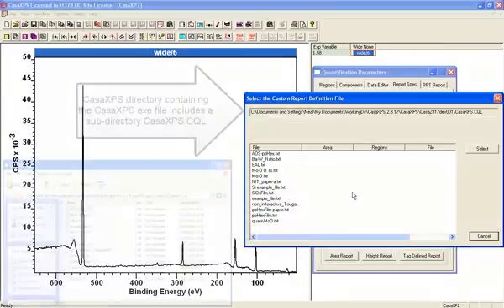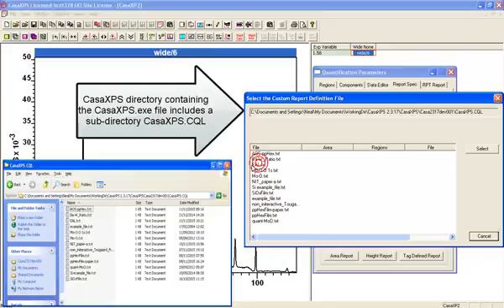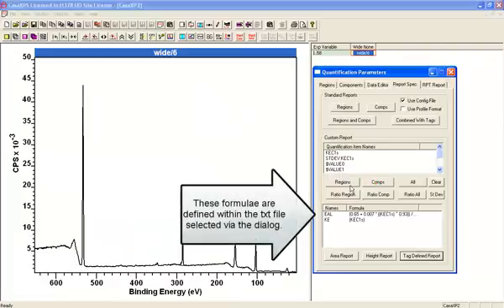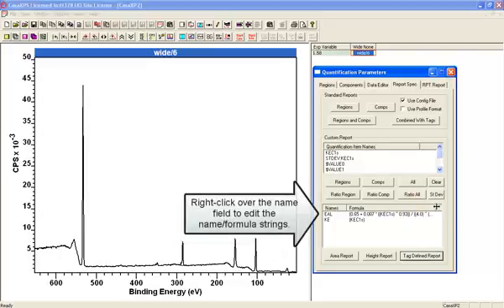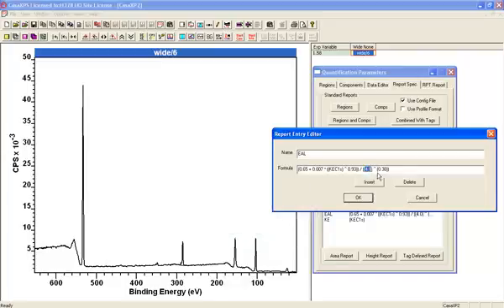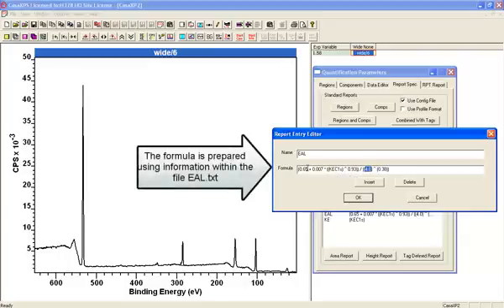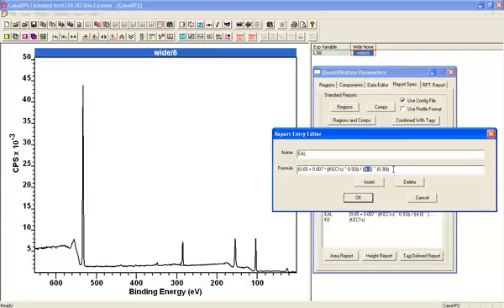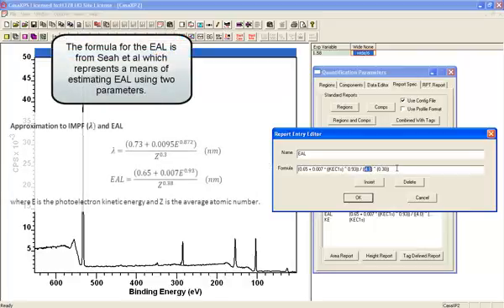So we're going to use that kinetic energy and I'm going to use a file that's been prepared previously. I've created an expression that will calculate an effective attenuation length. For a polymer with a mean Z value of 4, the kinetic energy — and these numbers are from a paper by Sear — gives you a method for calculating attenuation length given the kinetic energy and the effective Z value for the material.